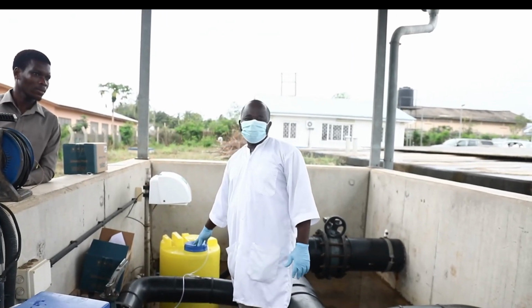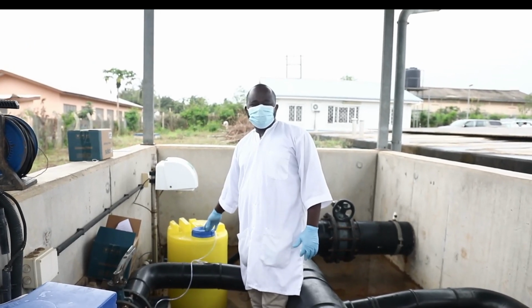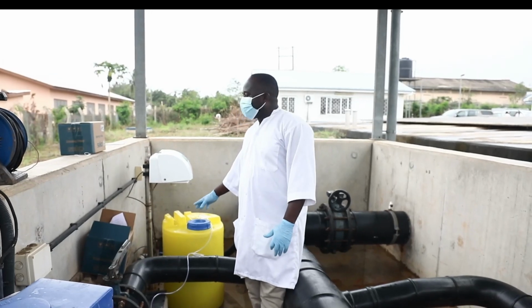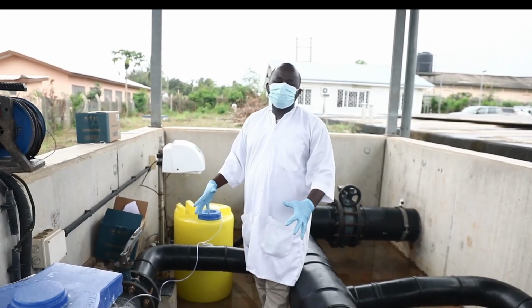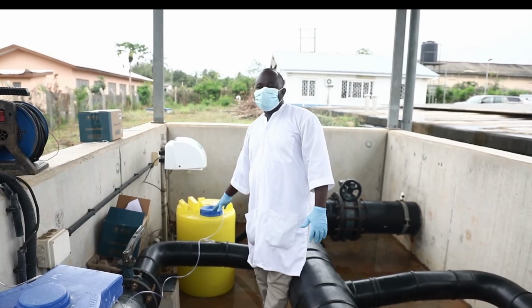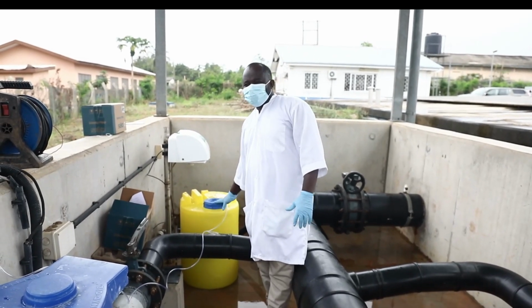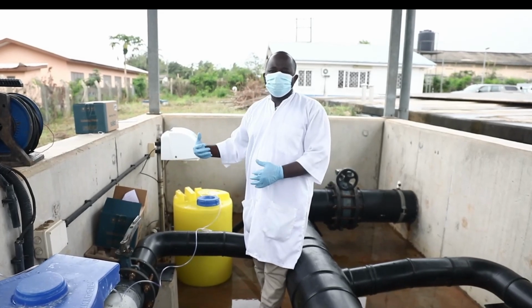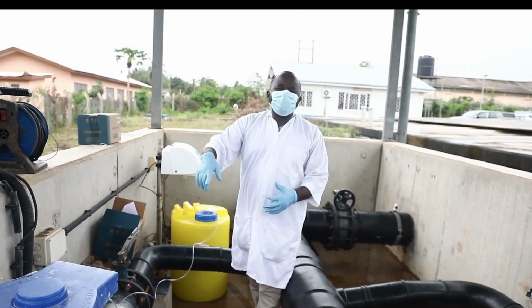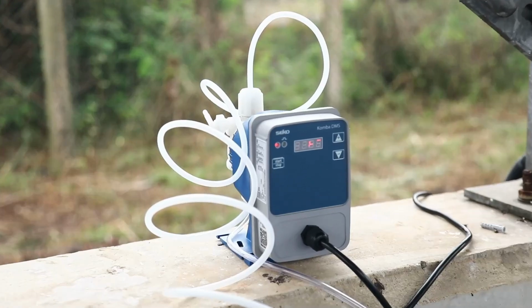Okay, so now we are done preparing our stock solution. Like I already mentioned, a stock solution is a solution whose concentration is known. And then, like I said, the whole amount of chlorine they are supposed to use in a day, we dissolve it in here. So this solution is very concentrated. So out of this stock, as and when the flow is going, they will be dropping the required amount with the help of the digital doser to disinfect treated water.